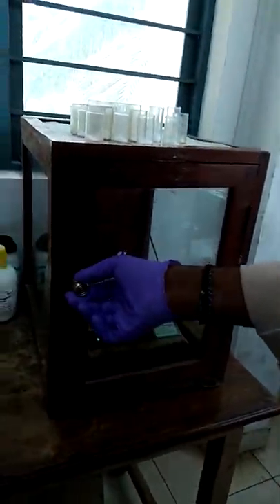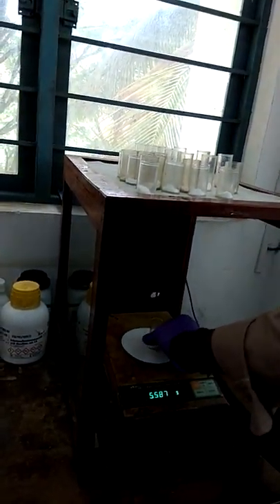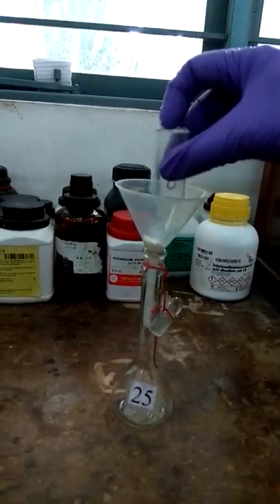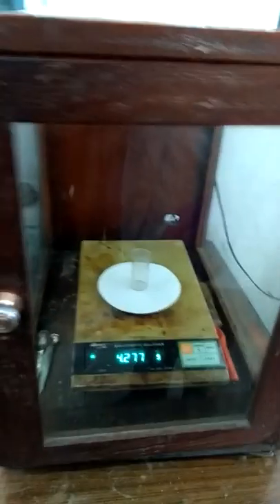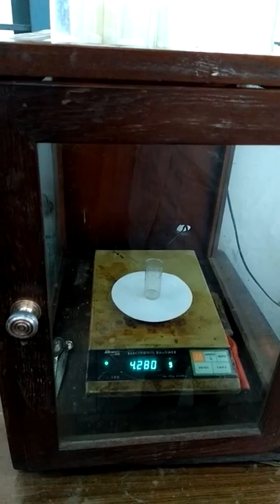5.588. Once it is stabilized, you take out the sample and transfer it completely into your volumetric flask. Then keep the empty bottle back and measure its weight immediately. Close the door and note down the weight of the sample bottle, 4.280. Then take out that empty sample bottle and keep it back. Then close the door and take out the volumetric flask.